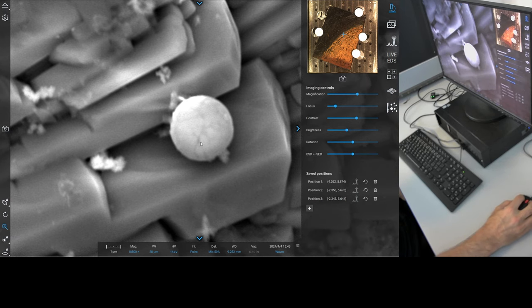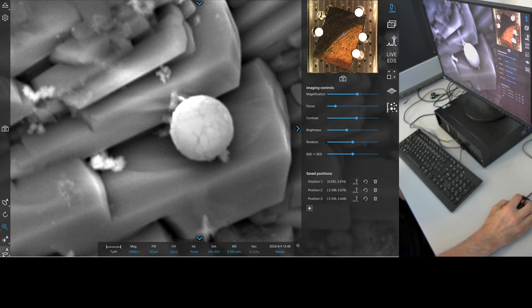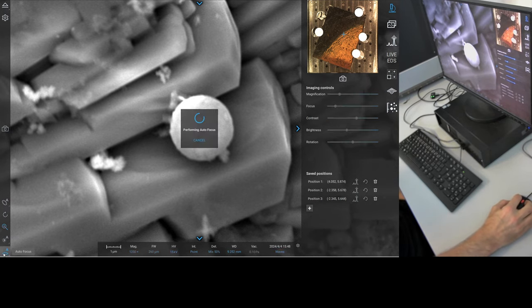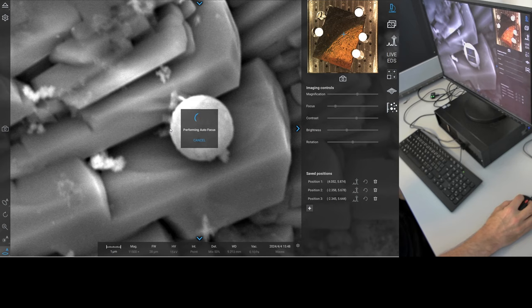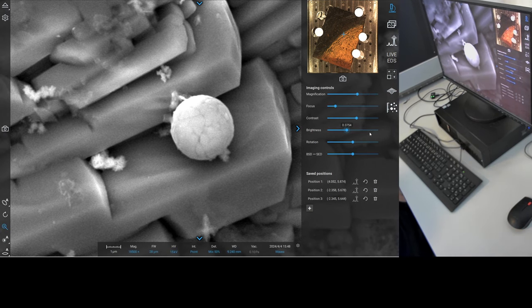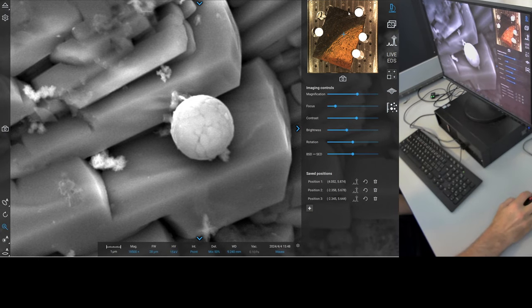Oh, hold on. Wait a minute. Is that it? Yeah, because they're at the end of the sulfur structure. Little baby crenelations? Yeah. Two microsphere? Yes. You see? Yes. I know what I'm looking for. There they are, there they are.